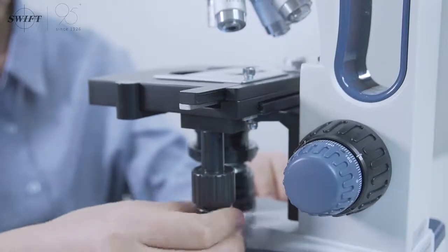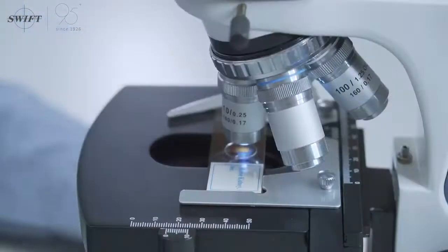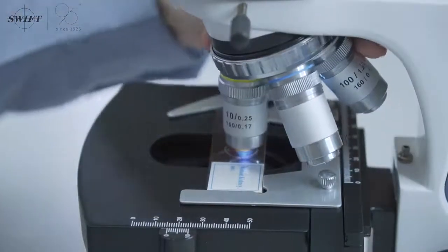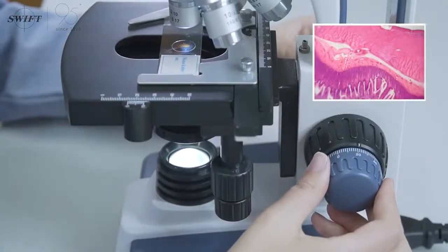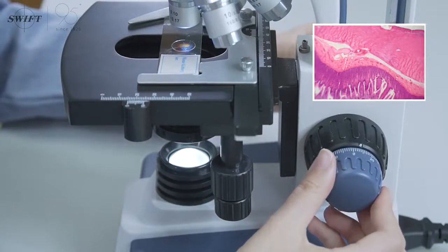Move the target slide to be observed to the center of the view. First use the scanning objective lens to find the target, and use the coarse and fine focusing mechanism to adjust the image under the microscope to be clear.